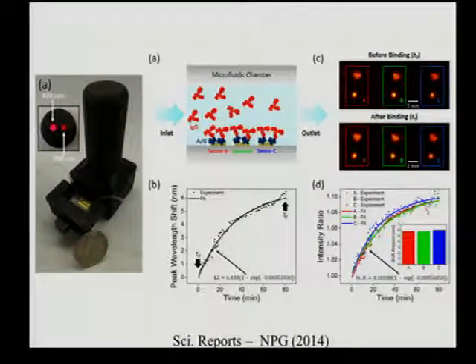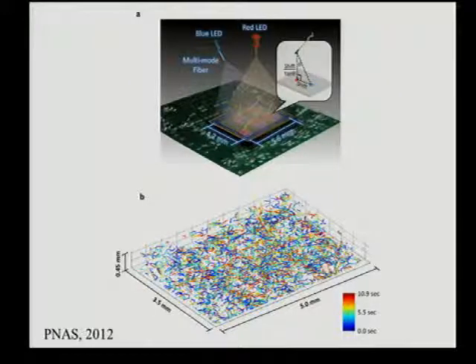So far, we've been discussing microscopy approaches based on computational imaging on a chip for mostly static objects. I didn't discuss time in my presentation so far. We were looking at static objects that will potentially be tossed away or stored for further diagnostic analysis, like any other system. But on-chip microscopic imaging with these kinds of partially coherent fields is also quite unique for tracking micromotion at extreme throughputs. I'll give you examples of that and the results that this kind of platform enabled.